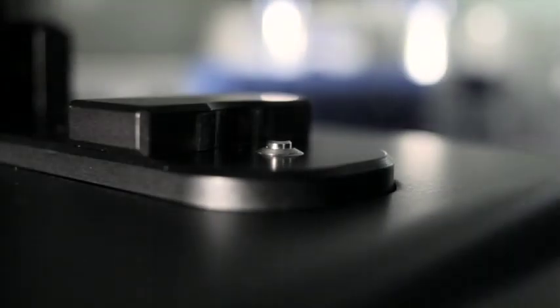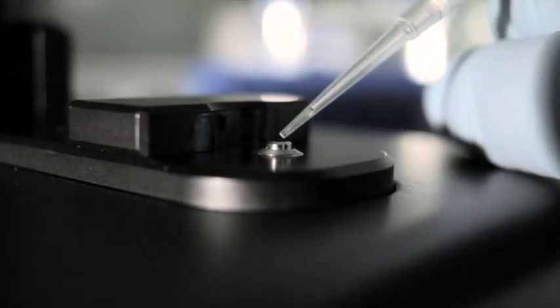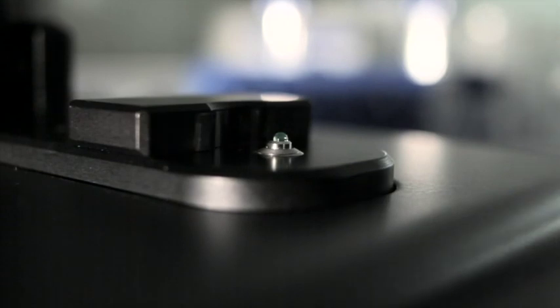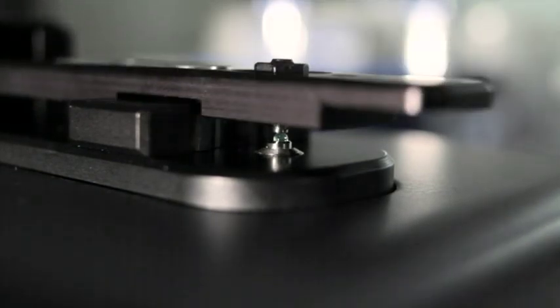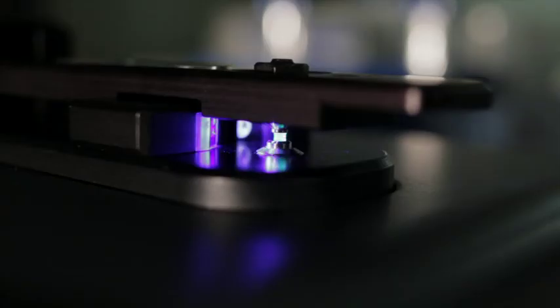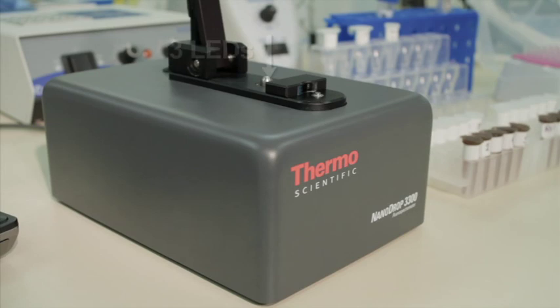The NanoDrop 3300 fluorospectrometer employs the same patented microvolume sample retention system as the NanoDrop 2000C spectrophotometer, with fluorescence measurements being performed with as little as 1 microliter of sample. The user chooses one of three LEDs as the excitation source, which fires at the sample horizontally. The subsequent sample fluorescence is then collected at a 90-degree angle vertically into an internal spectrometer.